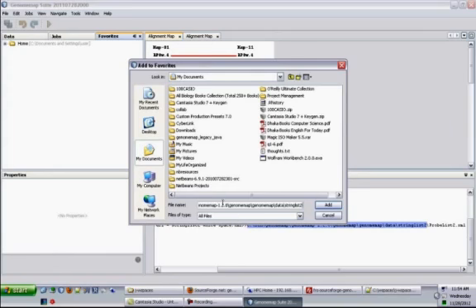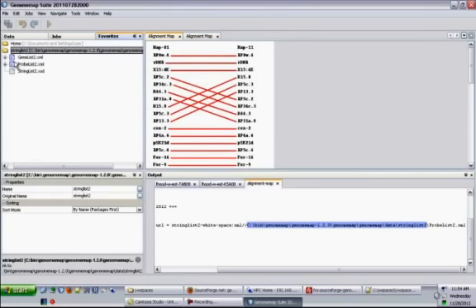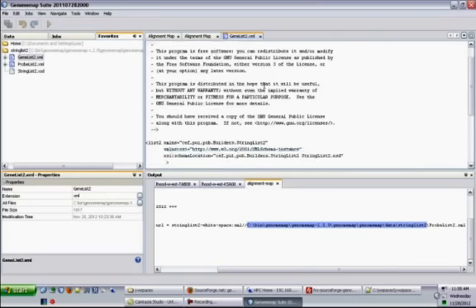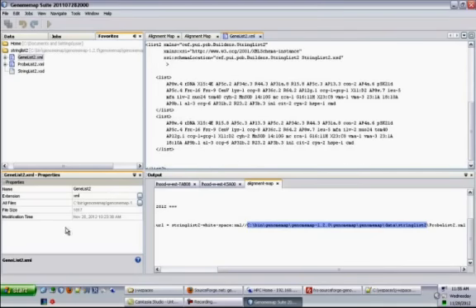If you put the path, then you see in this directory all these datasets are there. So you can also edit this file. This is the file that is being used for running this job. So you can add more maps here.